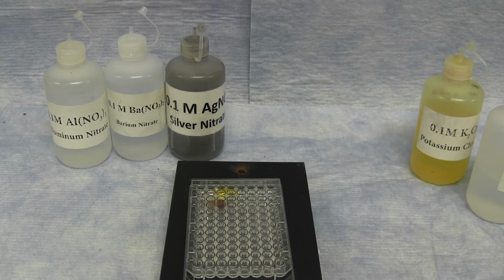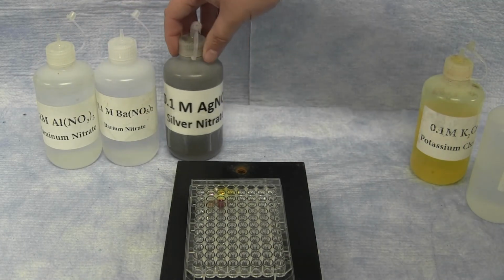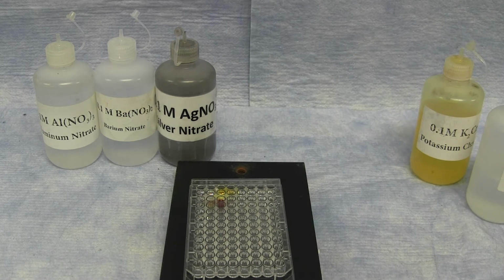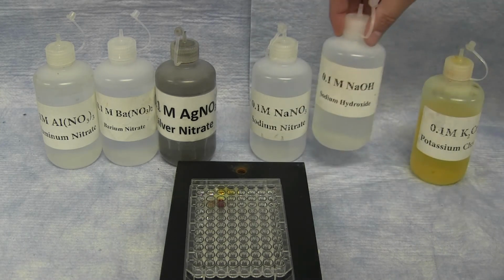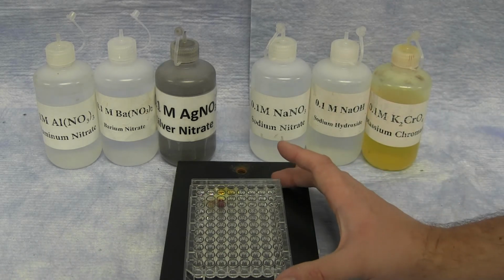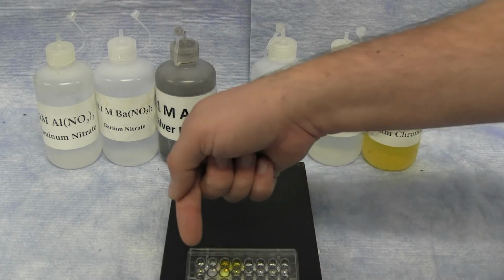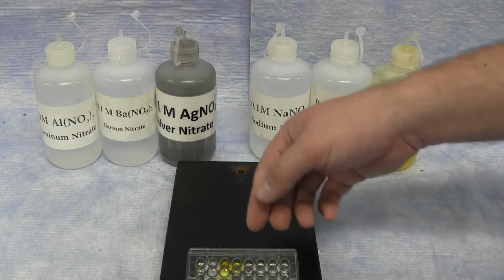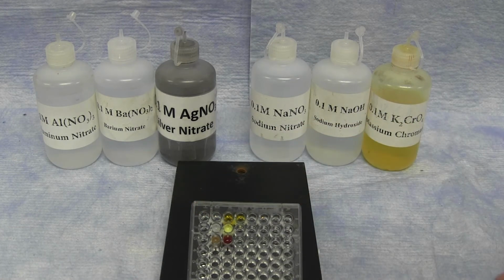Now, on just our small array of aluminum, barium, and silver nitrate salts, reacting with sodium nitrate, sodium hydroxide, and potassium chromate, you can see that the aluminum nitrate along the top did not precipitate with anything.